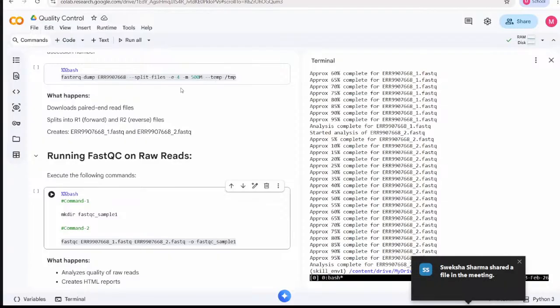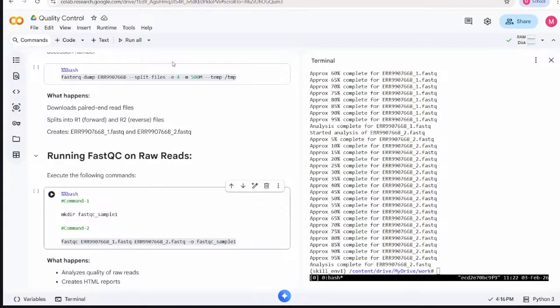Yes, sir, I sent. So your command is executed successfully. Yes, sir. Okay.